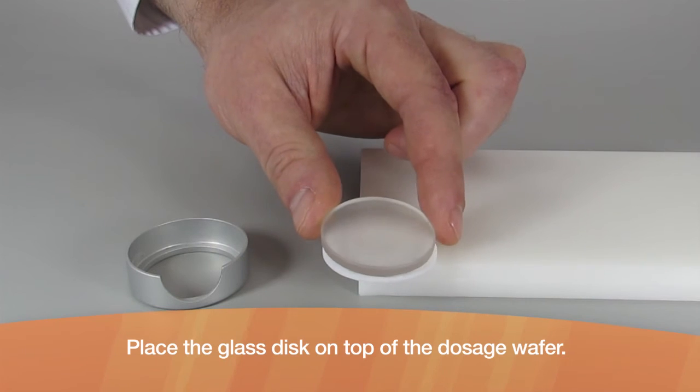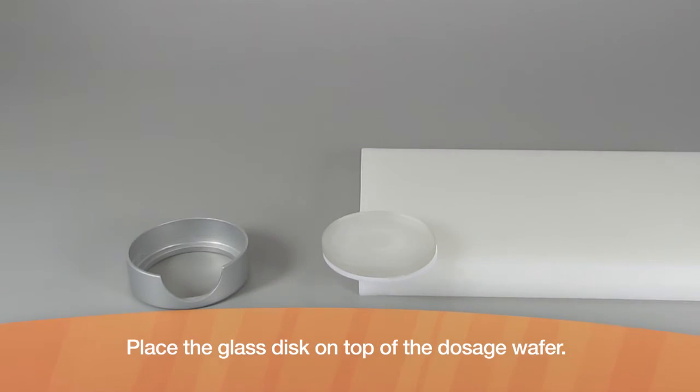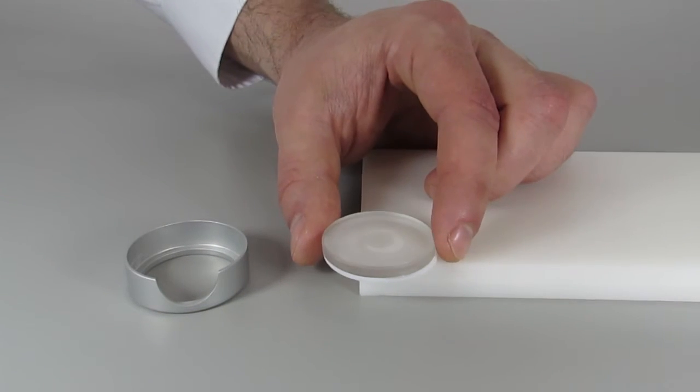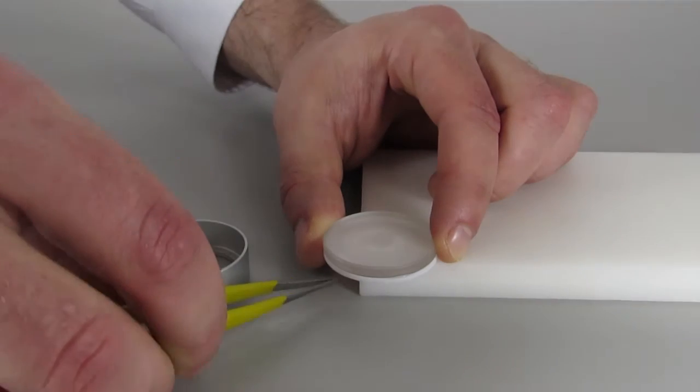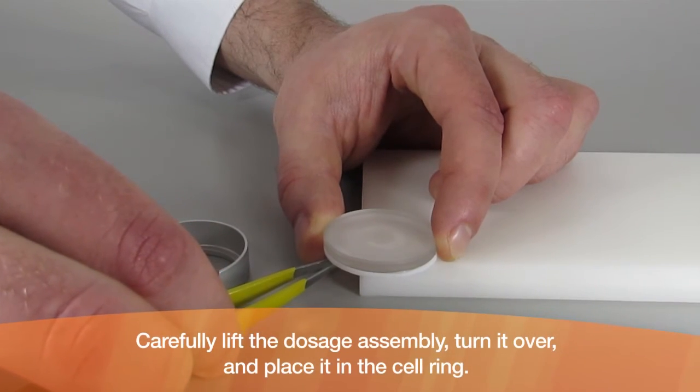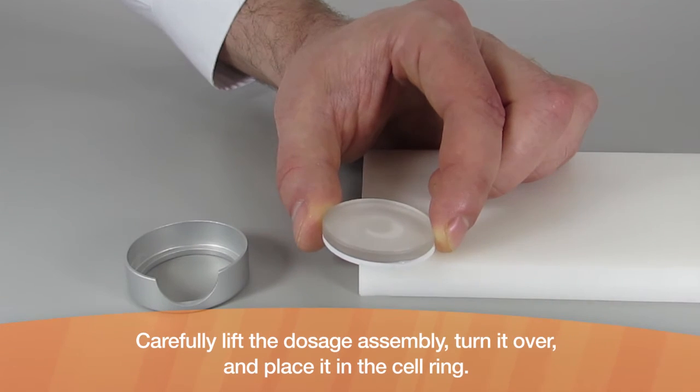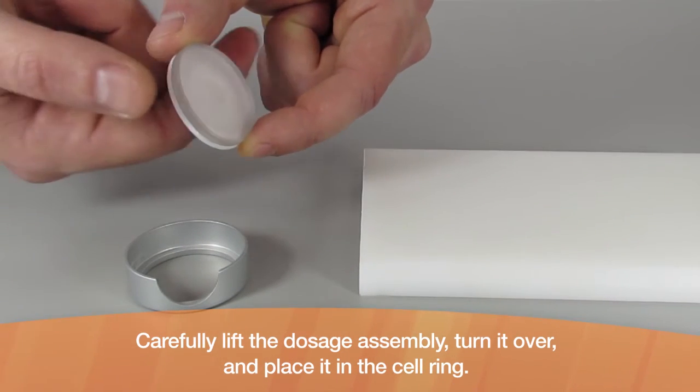Place the glass disc on top of the dosage wafer. Carefully lift the dosage assembly, turn it over, and place it in the cell ring.